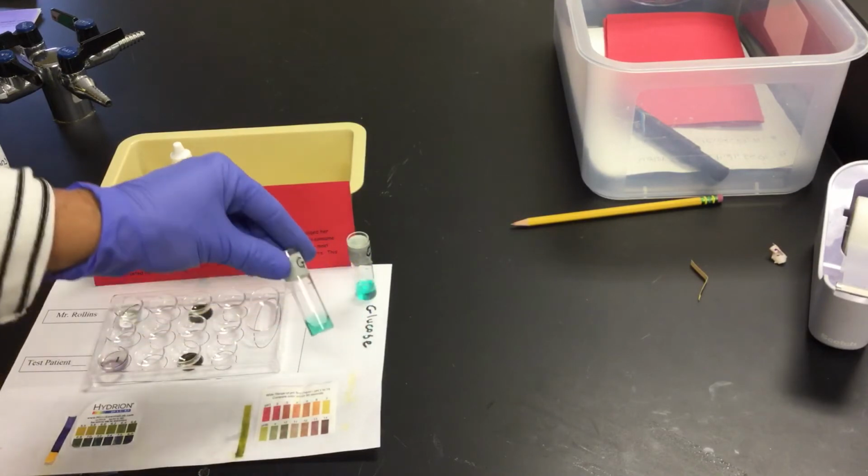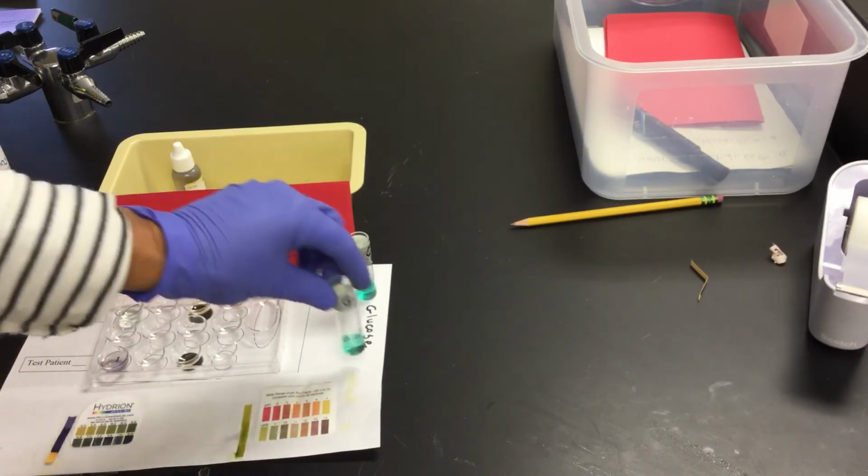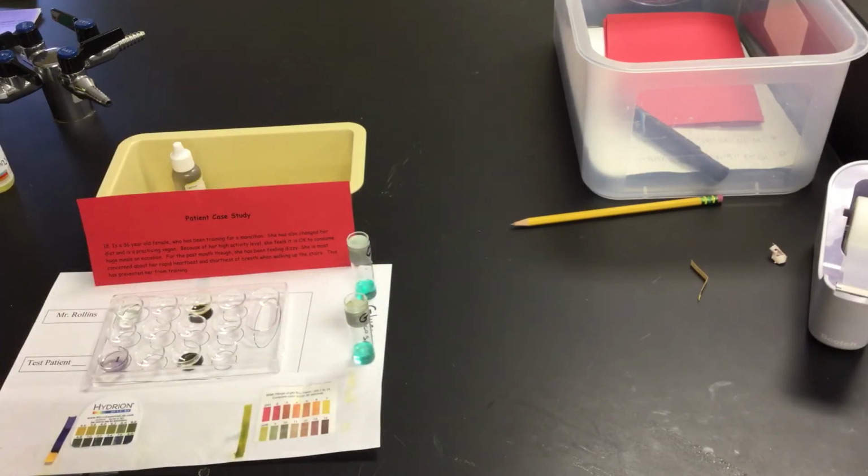Patient number 18, we did the same thing. We added urine, we added Benedict's solution, we put it on heat. After 5 minutes, there are my results. Go ahead and fill in your data chart. Give it qualitative data too. What color is it? Put a color there, because that way if there's a color change, the person looking at it will know as well, rather than just looking at pluses or minuses.